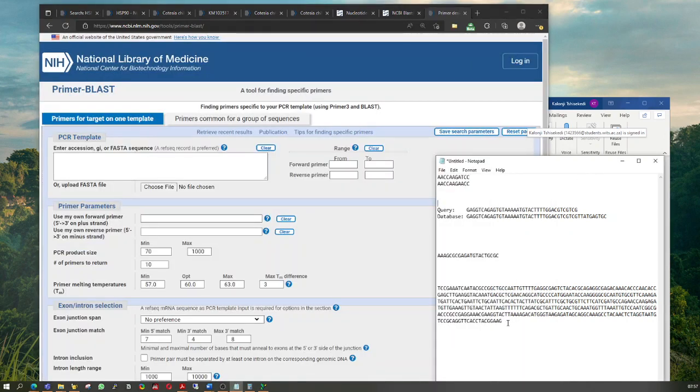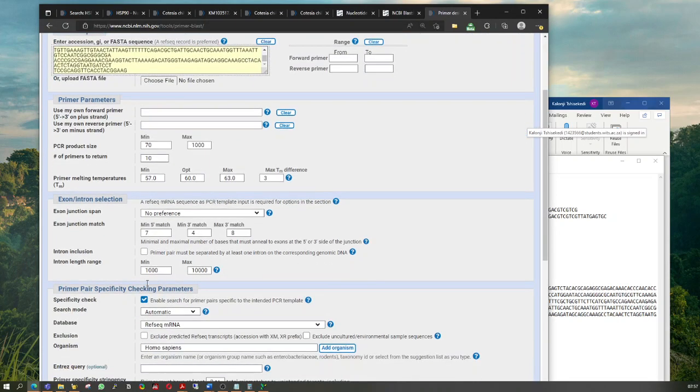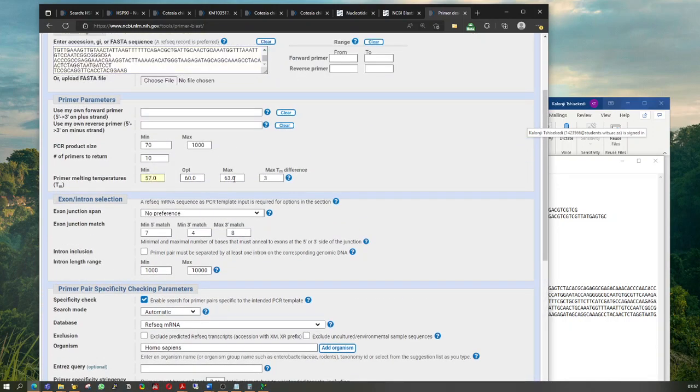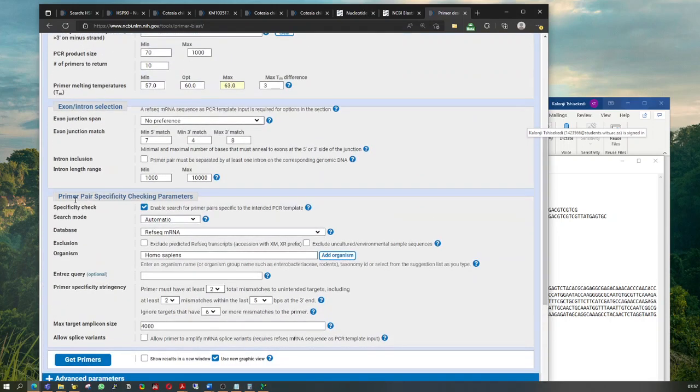So now that you've looked at the sequence and you're like, okay, I know what's going on here, and I'd really love to design primers to amplify that region. All you have to do, as soon as you understand the principle of primer design, which you should look in your pack note and all that, is set your specific melting temperature as a window.